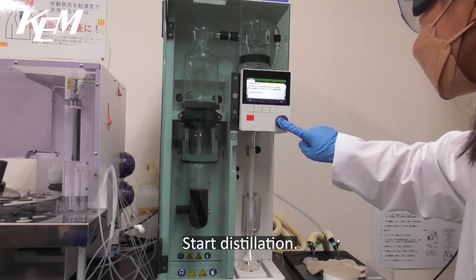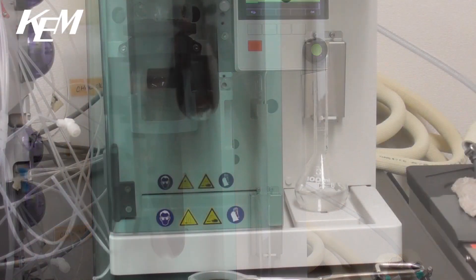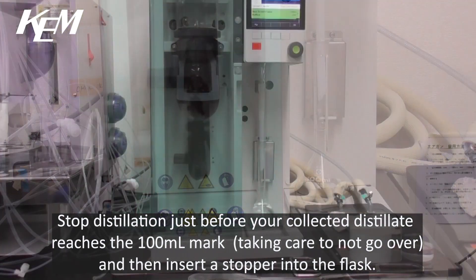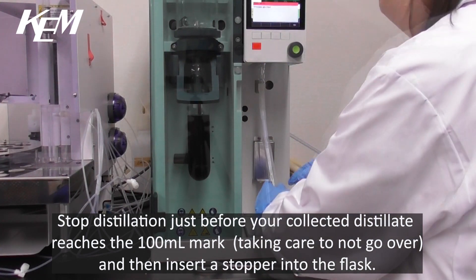Start distillation. Stop distillation just before your collected distillate reaches the 100ml mark, taking care not to go over, and then insert a stopper into the flask.